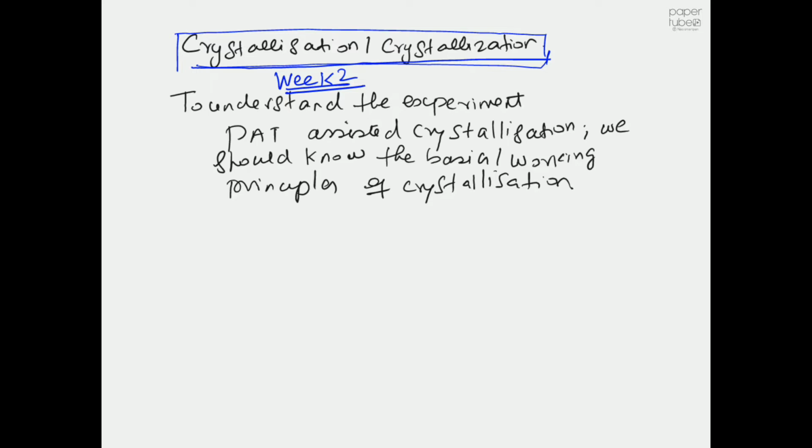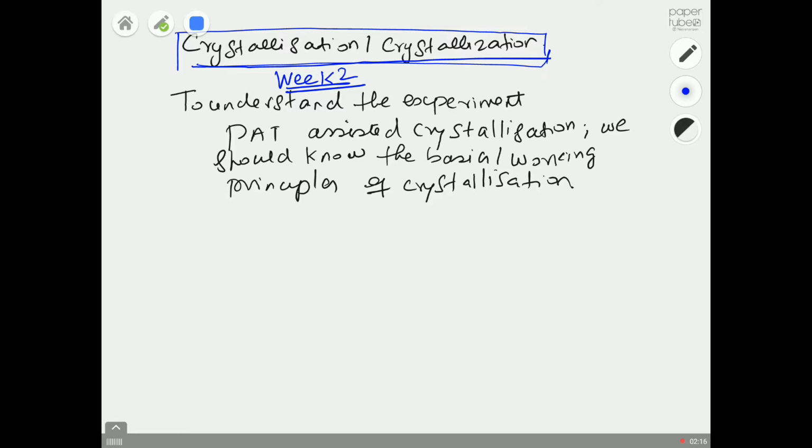I know the class is a mix of chemical engineering students, and we also have students from pharmaceutical chemistry and the graduate diploma in chemical engineering. I designed that particular experiment keeping pharmaceutical chemistry students in mind. They cannot leave this module without knowing about PAT tools, because that's something which is going to get them a job in the industry. In the lab video, in a few places I mentioned that there are no companies or industries at the moment, especially in Ireland, who operate without relying on PAT tools.